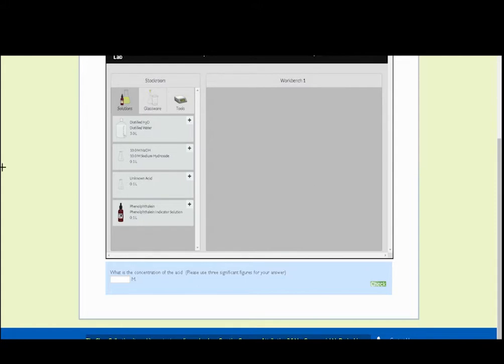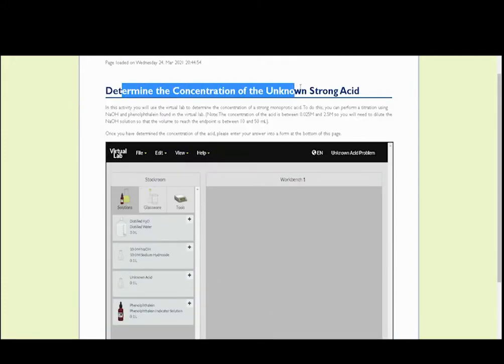What's up guys, Noah here, and today I'm going to be doing a chemistry video for you, so it'll be pretty exciting. We're going to be showing you how to determine the concentration of an unknown strong acid.